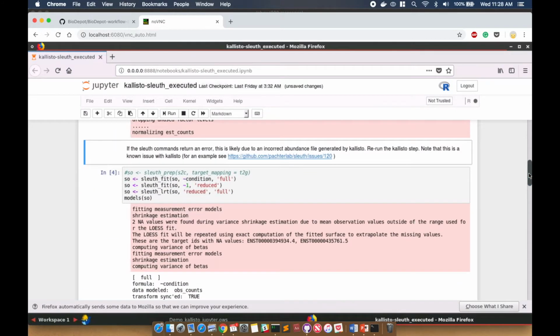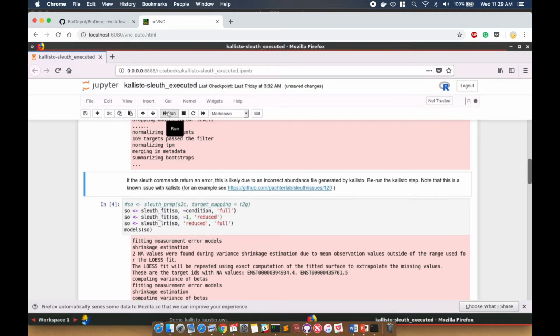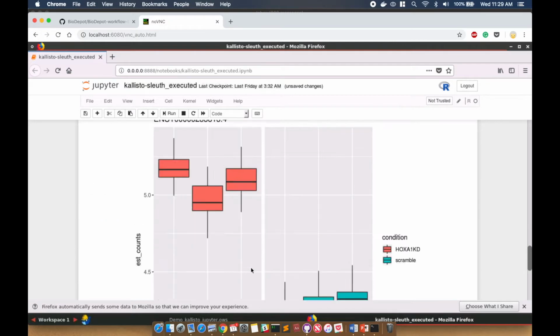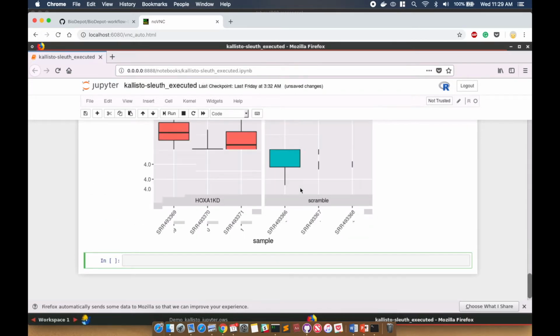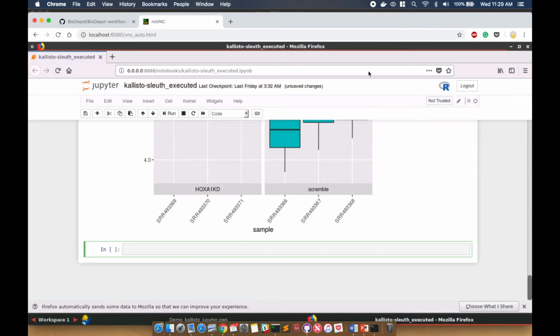Since this is a script that is run in the Jupyter notebook, there are many other things that we can do here. We can do machine learning, we can do various data processing and so on. So this is very flexible. We can see here that we can also do some visualization, for example. So really there are a lot of things that we can do after this.